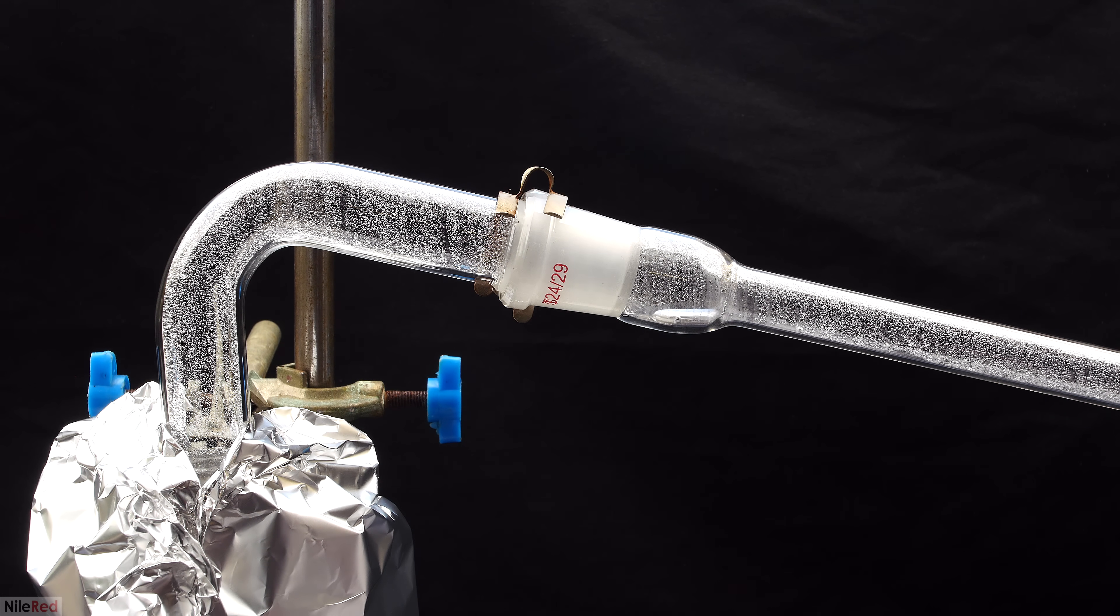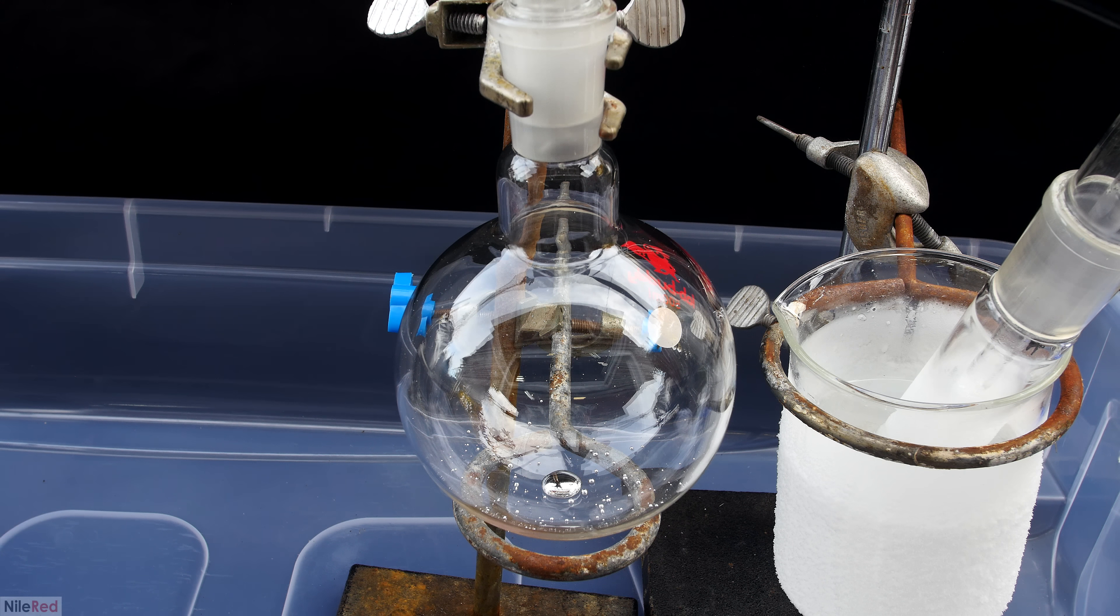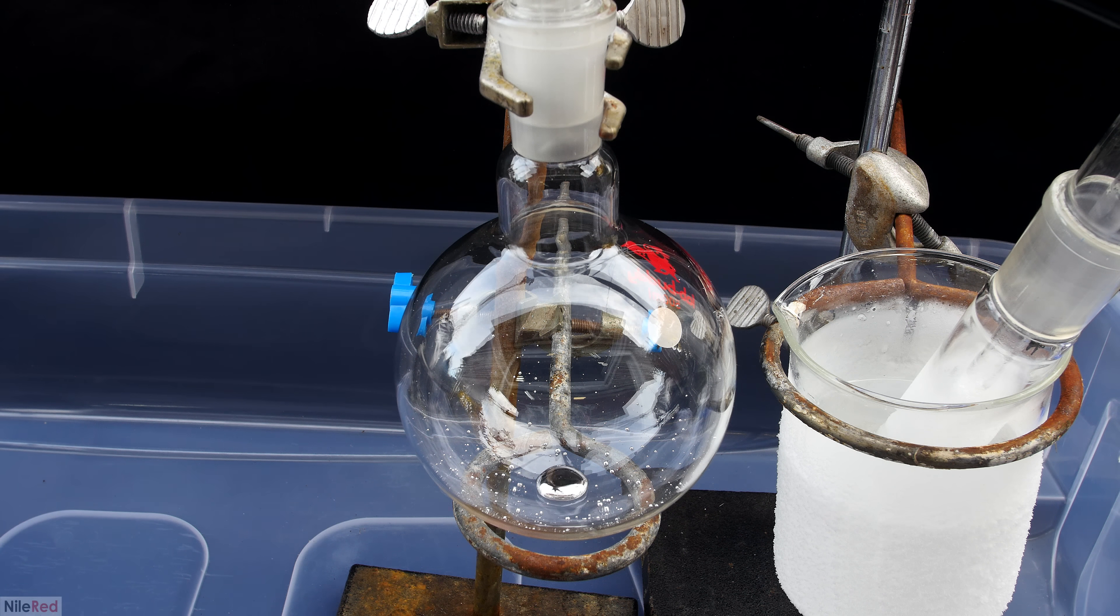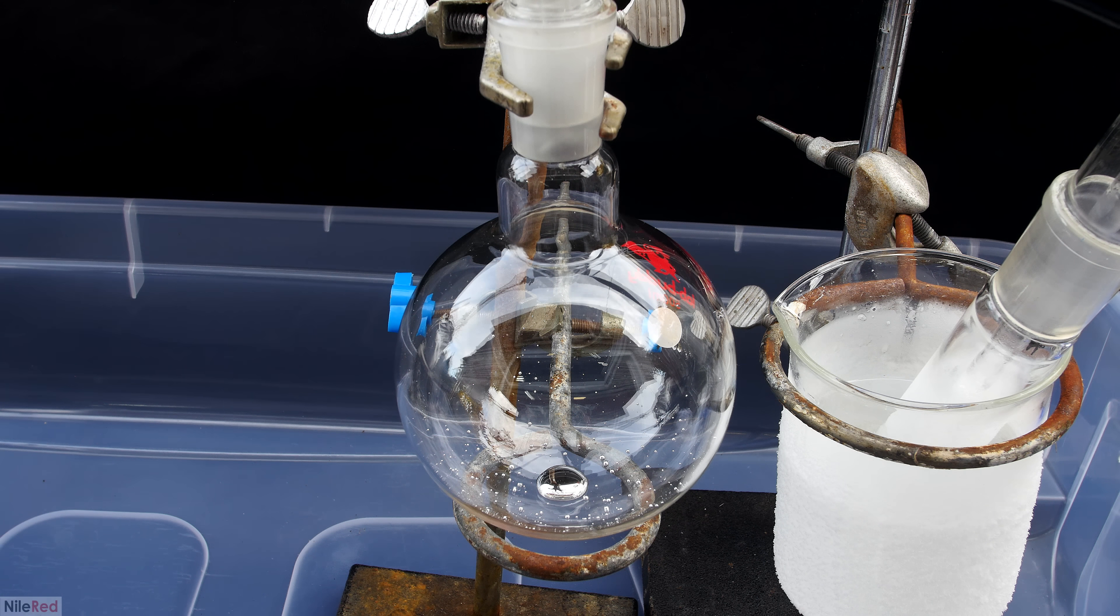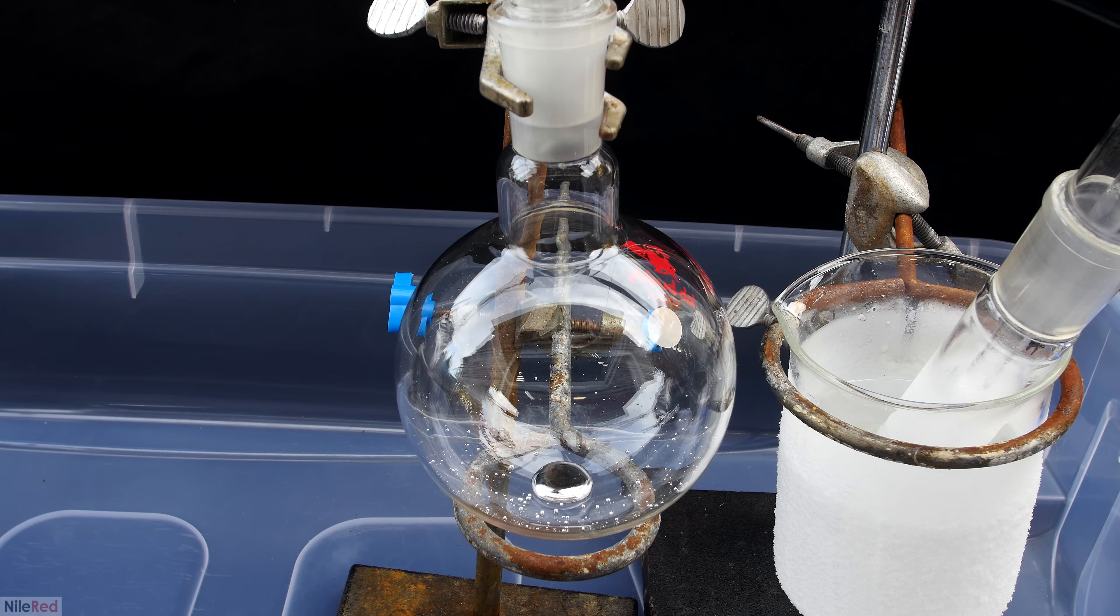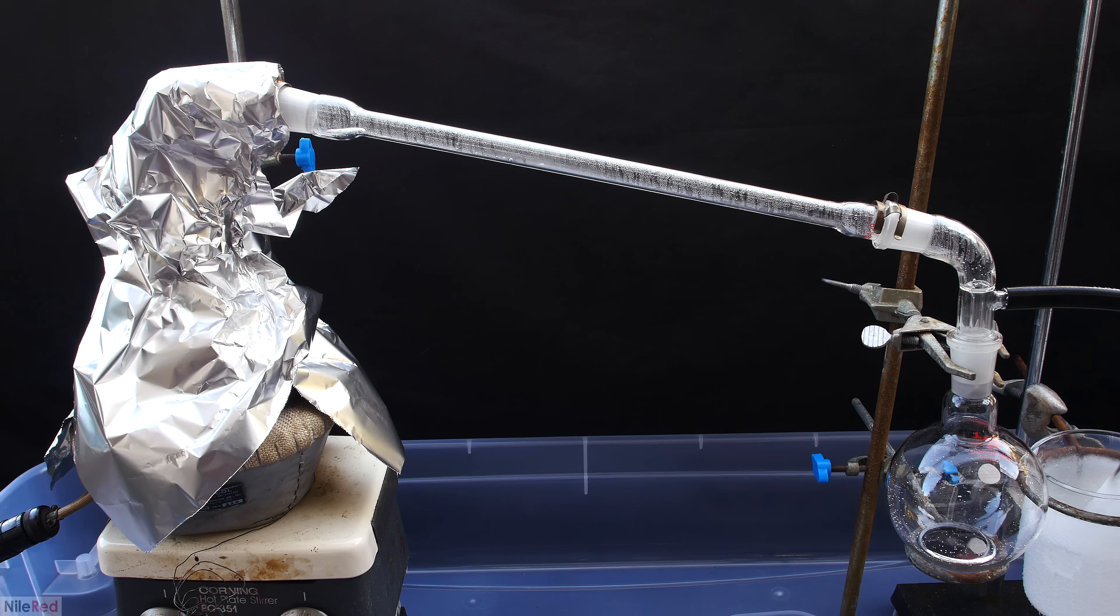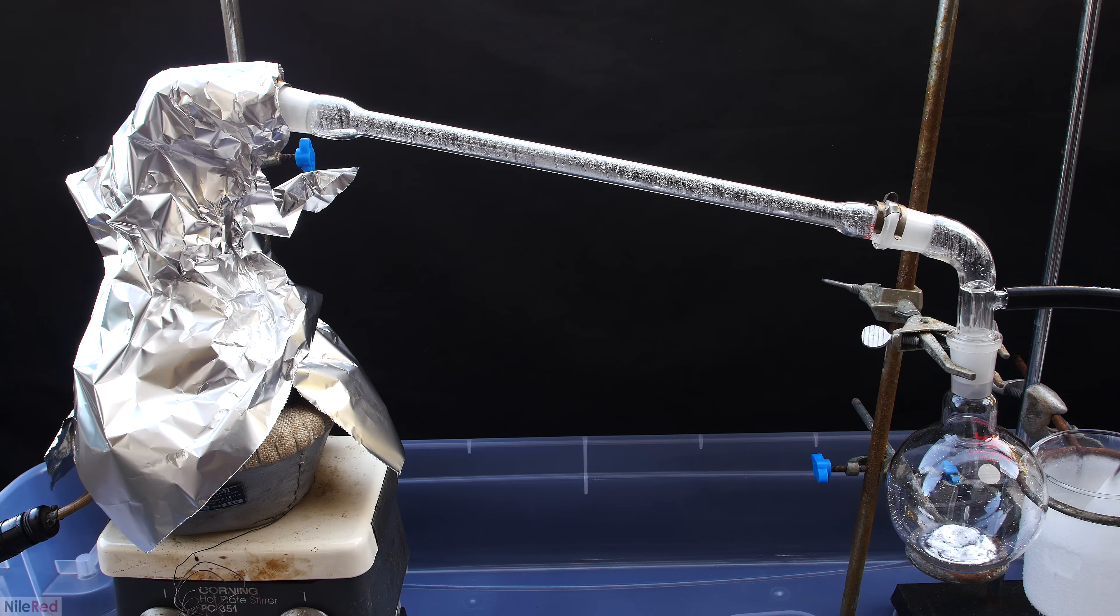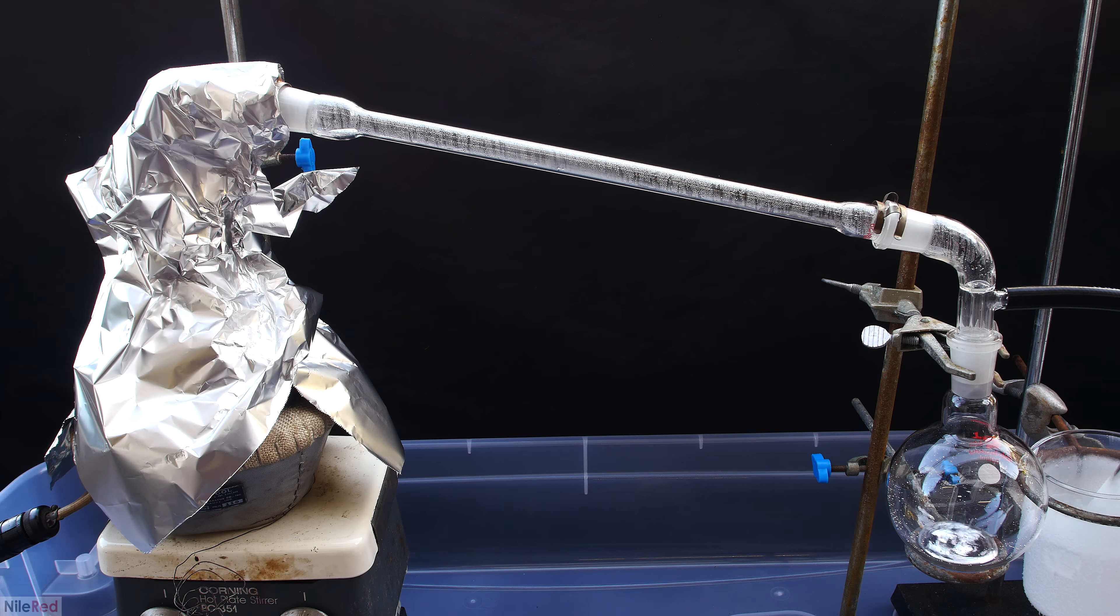A lot of the mercury vapor was condensing on the sides of the 1 liter flask, so I covered it with aluminum foil to try to insulate it and help the vapor come over. Now, when we take a look at the receiving flask, we see that we're collecting some nice and clean mercury. From this point on, things are pretty much in autopilot, and we just have to wait for everything to distill over. To increase the rate of distillation, and to help the mercury make it over, I decided to insulate the adapter as well.